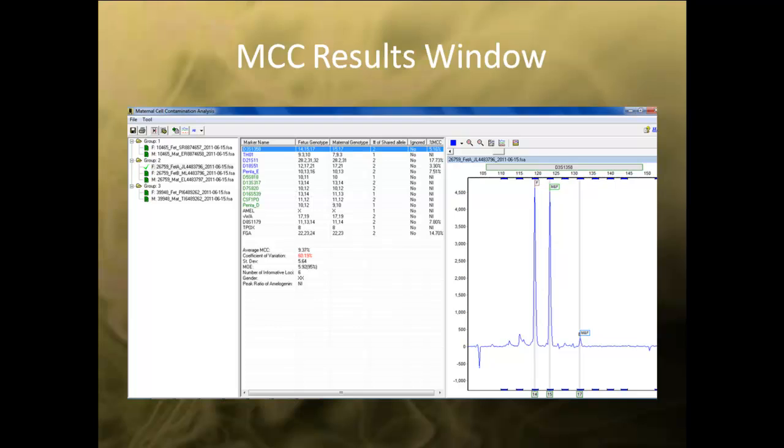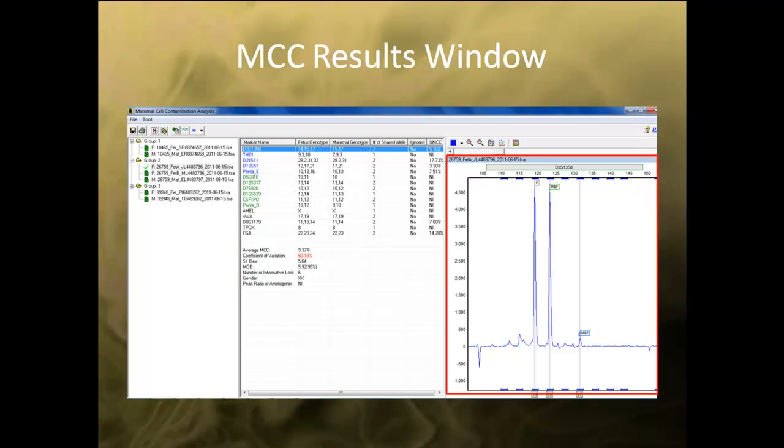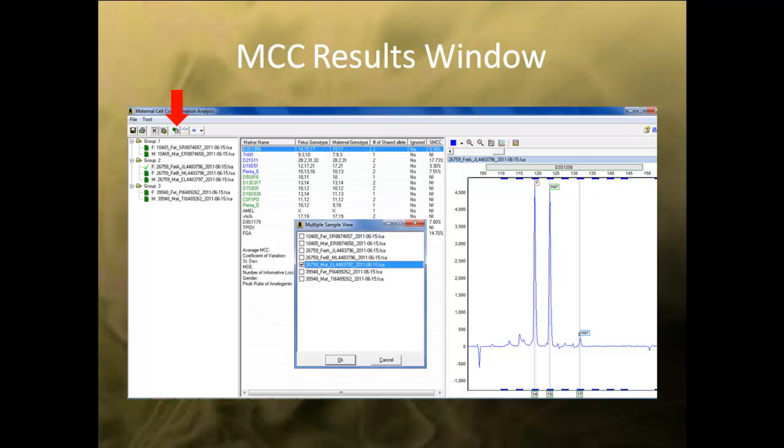The MCC results window is divided into three separate panes. The left pane is the browser pane and contains a list of all the samples in the project. You can select which sample to view by double clicking on it. The middle pane contains the calculated results for the selected peak and lists the genotypes for both the maternal and fetus sample. The right pane displays the electropherogram of the sample selected. The electropherogram will zoom into the individual marker if it is selected in the middle pane. You can select multiple electropherograms to view at once by using the multiple sample view tool.